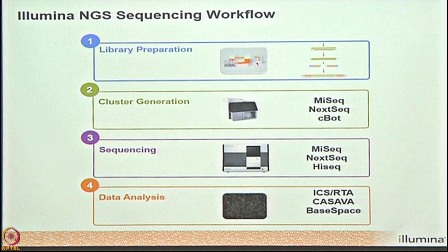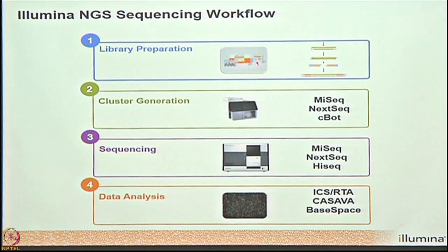What we do here is, I'll be covering all the parts one by one. The very first step involved in all the sequencers is library preparation, which is followed by cluster generation. Then comes the sequencing, and final is the data analysis part. Okay, so first is the library preparation. It's common for all the platforms. Though the sequencers are different, the concept remains the same.